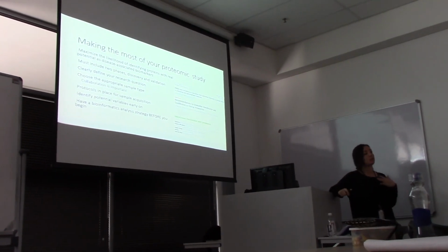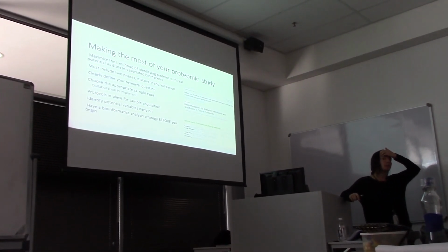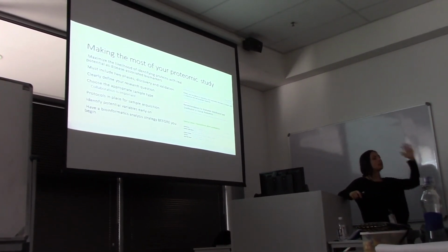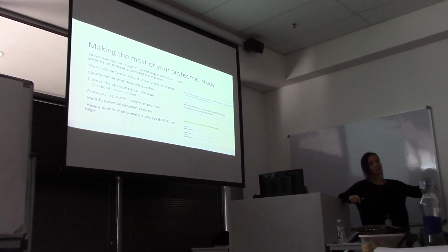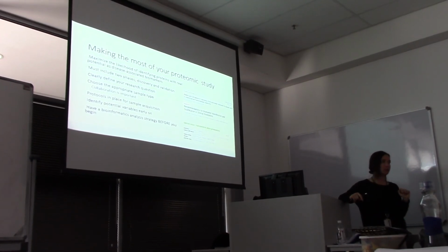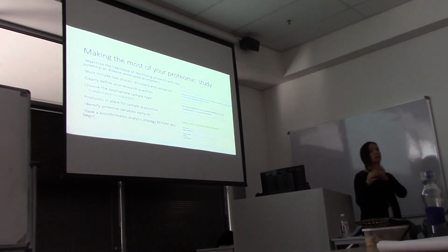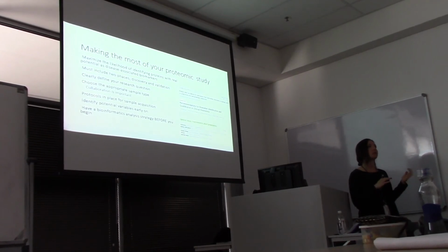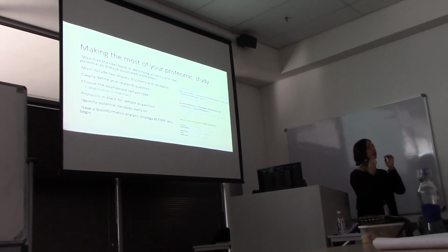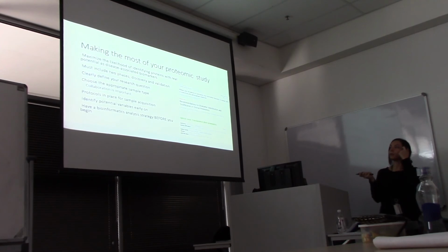Identify your variables early on. There are variables introduced because of your labeling strategy, because of the different sample types. I reviewed a paper where they were heat stressing these little mollusks. They basically dried out one mollusk and compared that to just a normal mollusk. But they were also interested in the rehydration of these mollusks. They had already done the analysis and they found things, but it didn't seem to correlate at all. I told them they should have looked at dried out and rehydrated versus the completely dried out. That would have been a better control. So try and think about these kinds of variables.